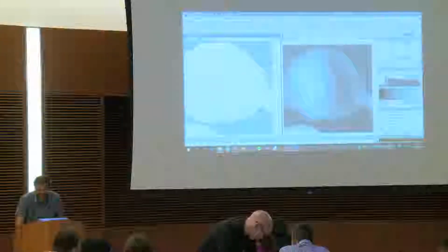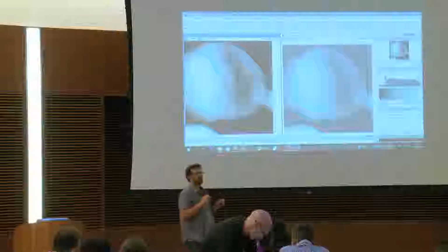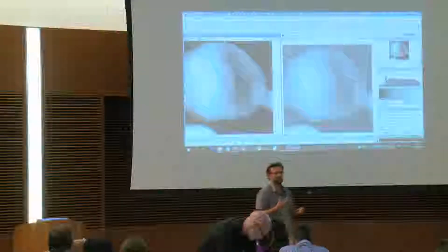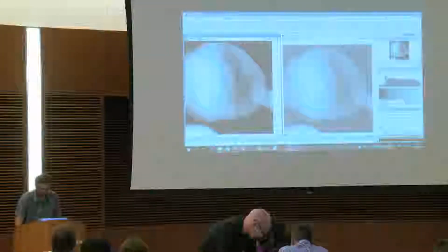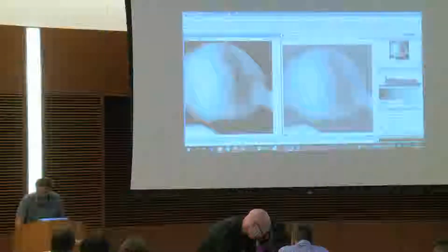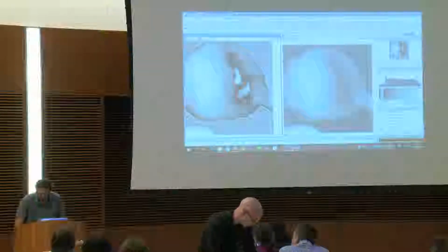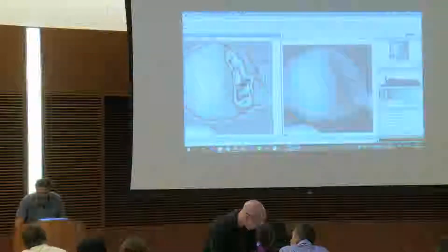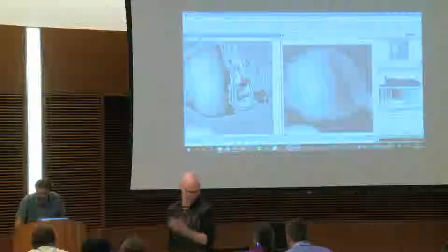Okay, so now we have this lookup table, and there is something funny that we can do with it: you can produce false 2D rendering with false color, and usually you're scared about the usage of false color. But for publication, it's cool because it's not always possible to put a proper 3D figure that is showing what you want. And here, if you go back and forward in your lookup table representation, you see that the knobs are appearing.